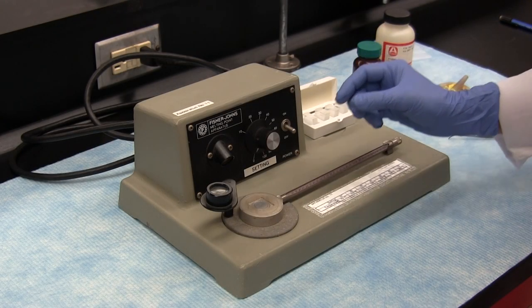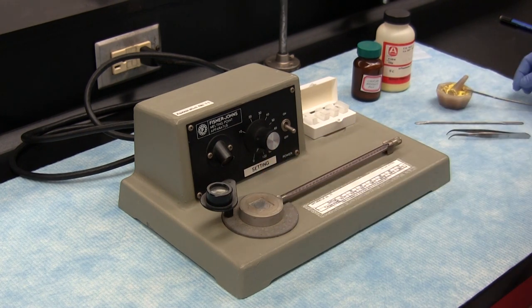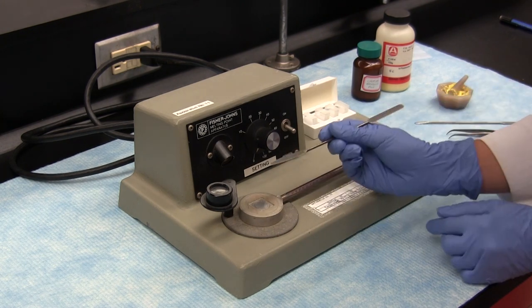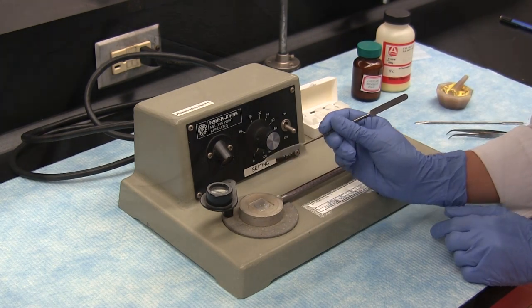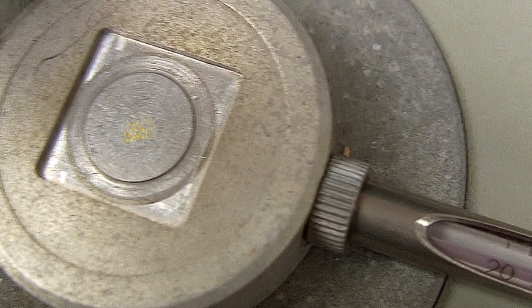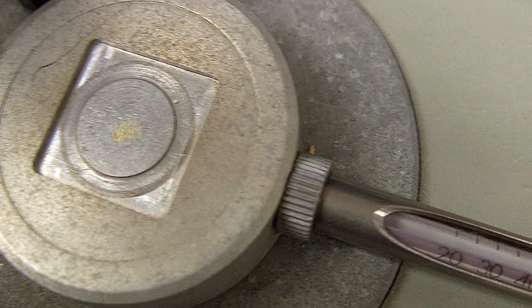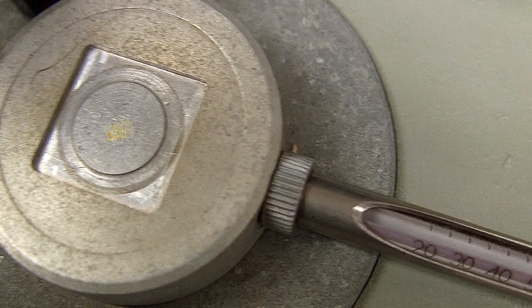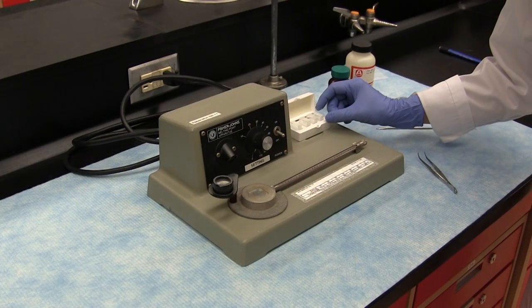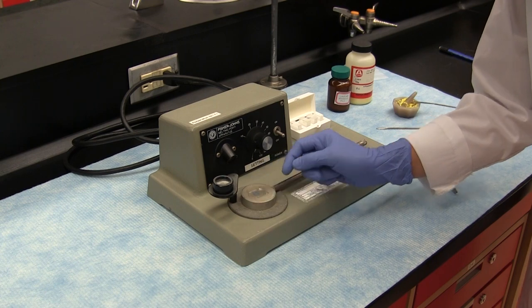To begin a melting point determination, a single cover glass is placed in the center of the stage, and then a few crystals of the solid material are placed on the cover glass. The smallest amount of solid material is all that is needed. Ideally, we need to be observing just a few crystals as they are heated up to the melting point. Using too much sample can easily cause an erroneous result. Another cover glass is then used to cover the crystals.